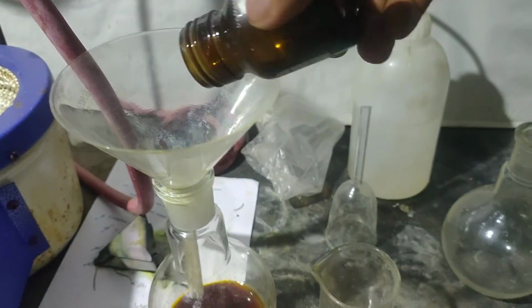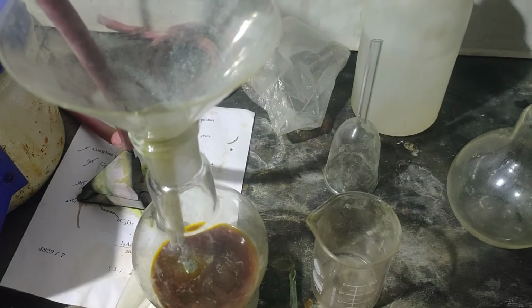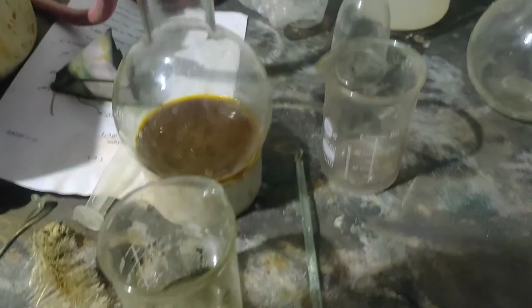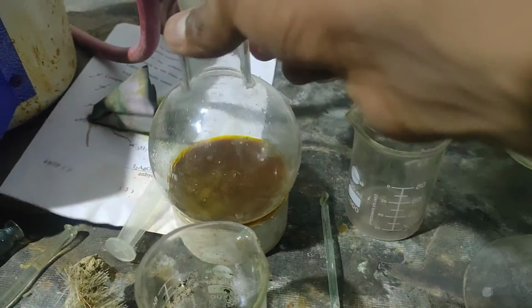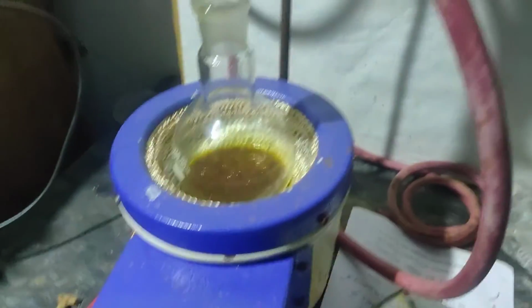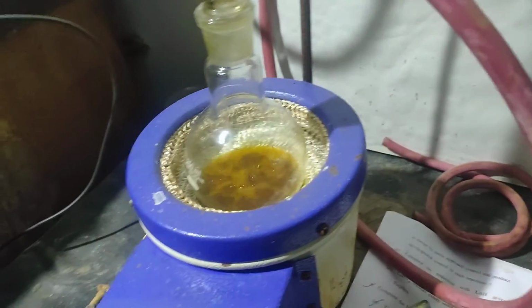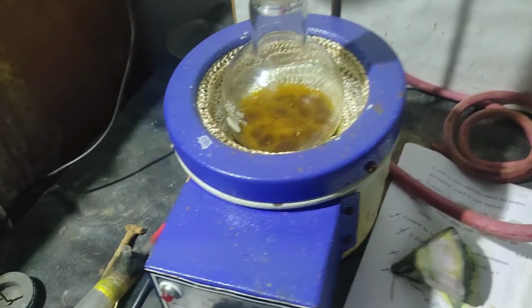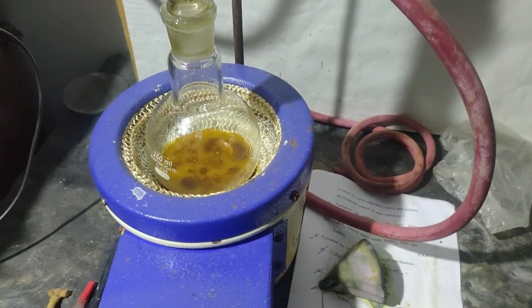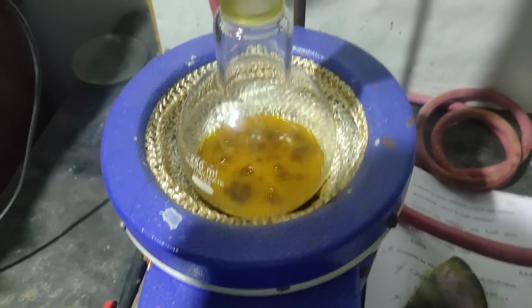I took out the flask and added some Devarda's alloy powder and then set it on reflux. But still, the yellow color of the solution was not fading. It means that nitrobenzene has been reduced to azobenzene, but azobenzene is not being reduced to hydrazobenzene. It is understandable, as aluminium needs water to react with potassium hydroxide to produce nascent hydrogen, and we haven't added any water to the reaction mixture.